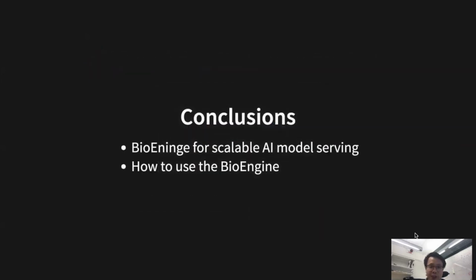So in conclusion, I have shown you BioEngine, which is a tool for scalable AI model serving. And I have been showing you this step-by-step tutorial on how to use BioEngine. Hopefully you get a sense of roughly how it works, and feel free to use it in your own application or to process your own images.